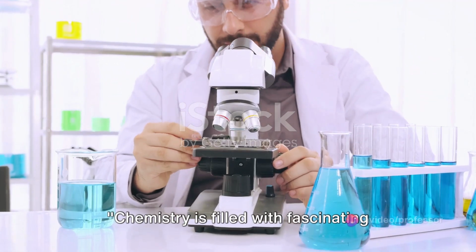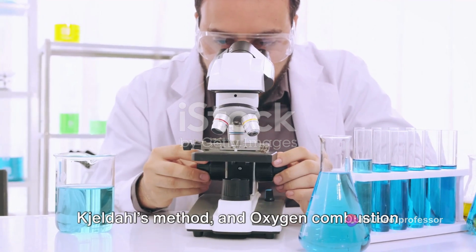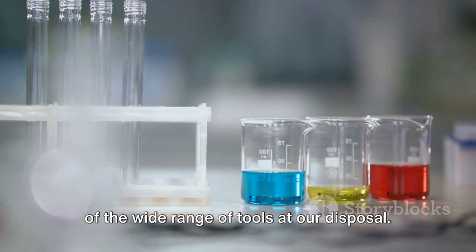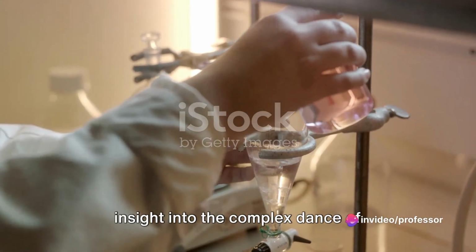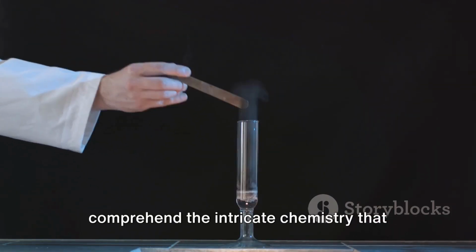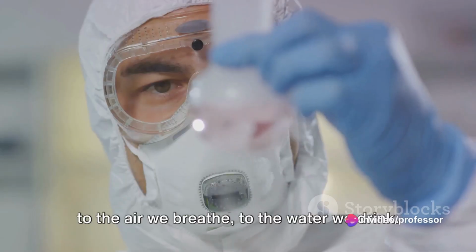Chemistry is filled with fascinating techniques and methods that help us understand the world around us. As we've seen, Karl Fischer Titration, Kjeldahl's method, and oxygen combustion flask techniques are just a few examples of the wide range of tools at our disposal. Each of these techniques offers a unique insight into the complex dance of molecules and elements that define our universe. They help us measure, analyze, and comprehend the intricate chemistry that underpins everything from the food we eat to the air we breathe to the water we drink.